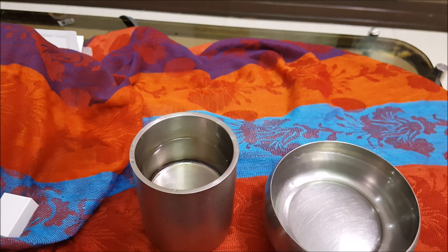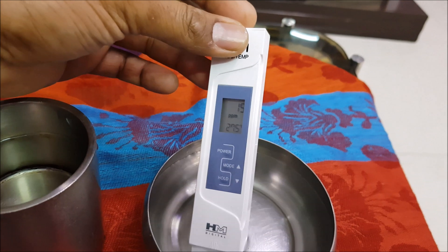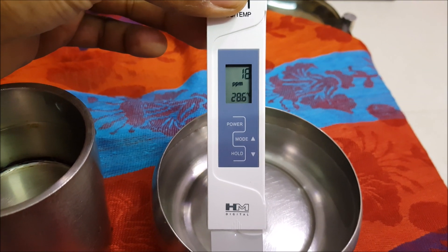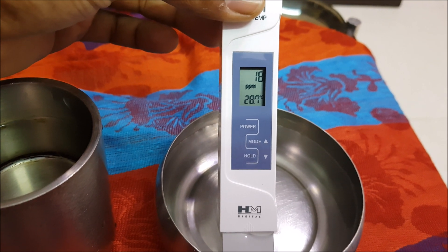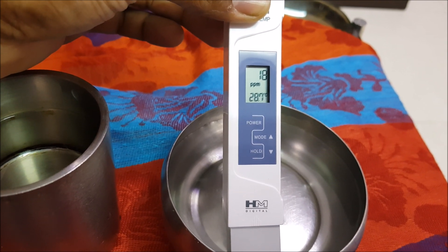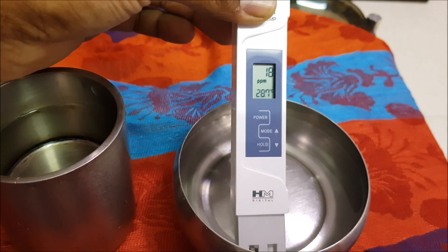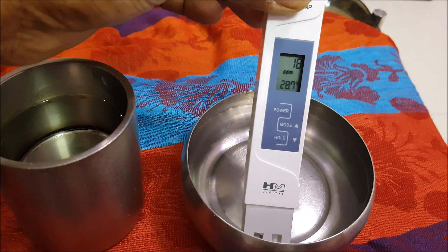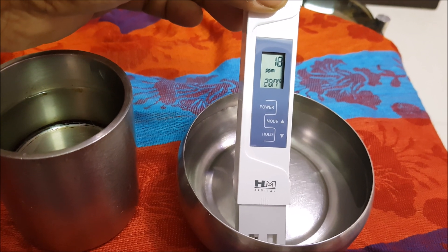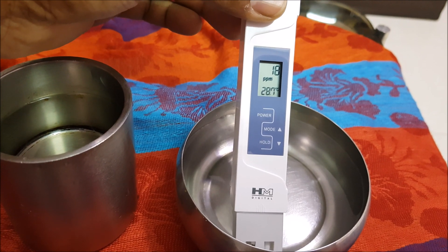Now let me rinse it and test the RO water. The RO water is coming in close to 18 PPM. Normally RO reduces TDS to about one-third or even one-fourth, so from 45 it would typically come down to around 12 or 13. This came out of an LG RO, model W180, and it has a mineralization stage, which is why the TDS is slightly higher at 18.